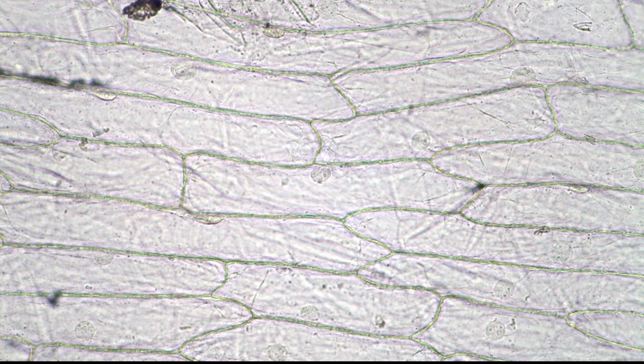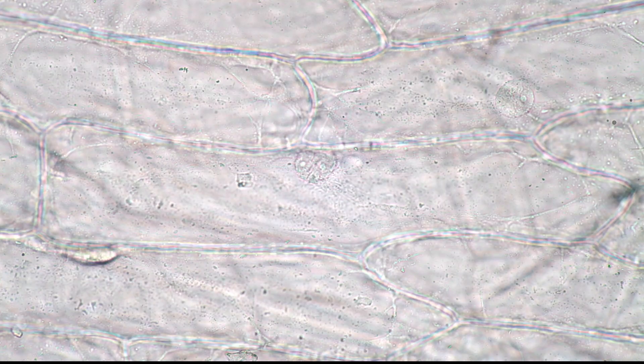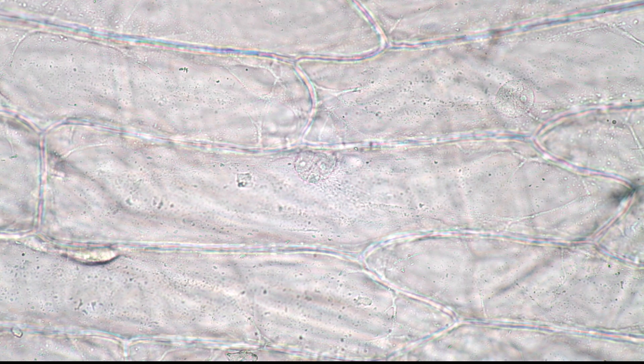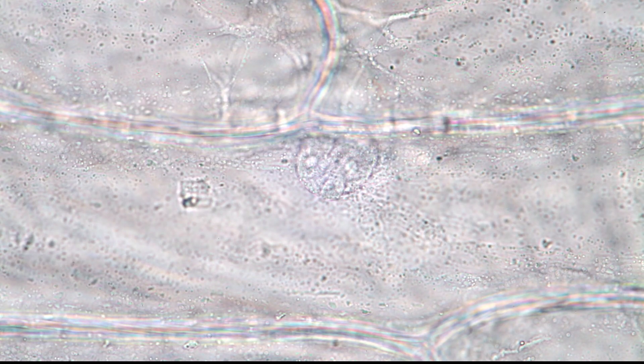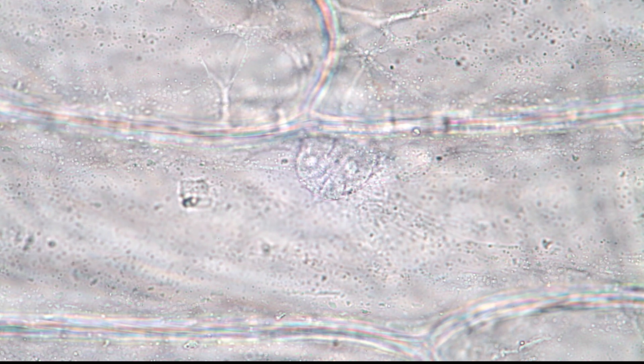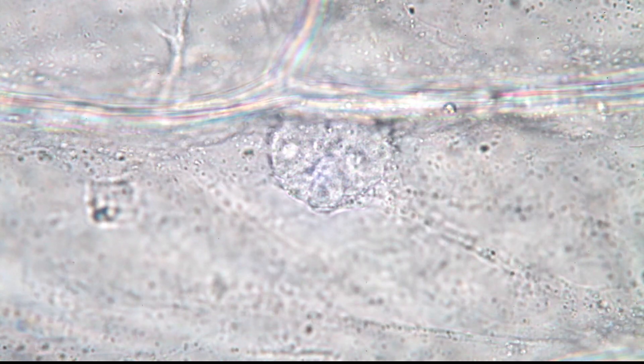Look at the cell in the center — I'm going to go a little bit higher now, using the 10 times objective. We can see that the central cell has a circle at the top, and this circle is the nucleus, which stores the DNA. At a higher magnification the nucleus becomes bigger — it's pretty much in the center — and now we can already see a little bit of movement. You can see that there are small dots streaming inside the cell.